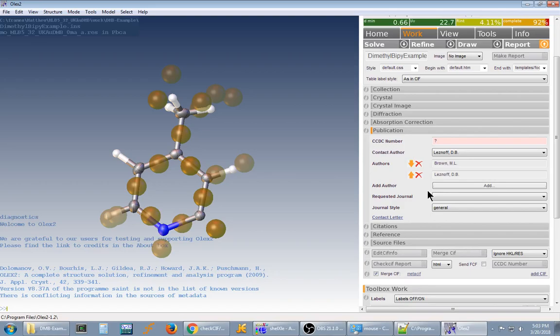So for example, on my first paper, I did the work on almost every crystal structure completely by myself, except for one of the early ones a more experienced crystallographer helped me with. So he was a co-author on the paper, and of course he was listed as a co-author in the CIF file, but it actually specifically said in the CIF file which structure he worked on, because why not? I'll show you a nice little trick in a second involving this.